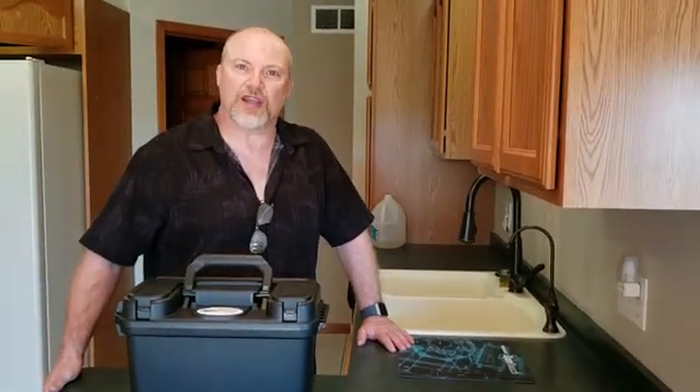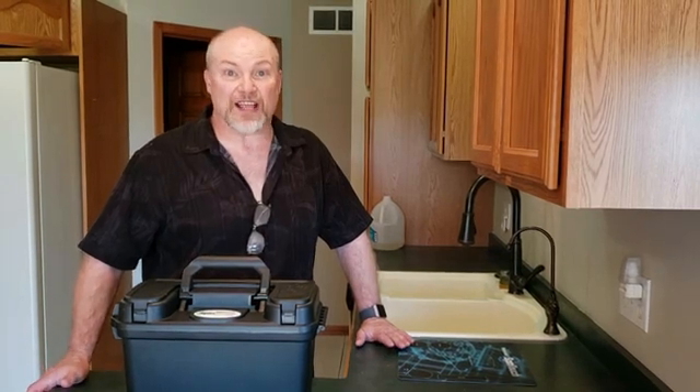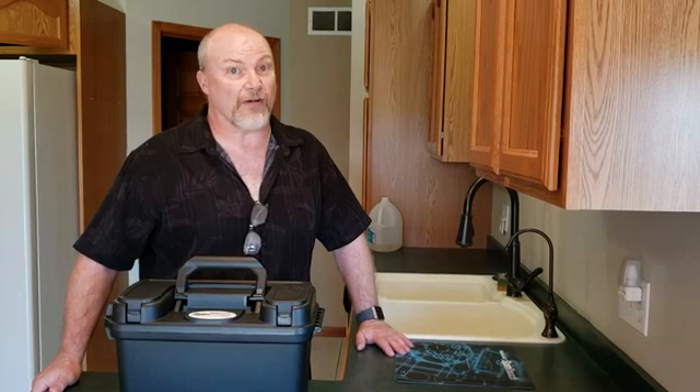Hi, I'm Kelly Thompson with Motor Vitality. I'm going to do a little experiment here which I'm very excited about. I saw this Spin Touch test kit from Lamont at the WQA convention in Las Vegas this year and I've been very excited to try this out and see what it does and how accurate it is.